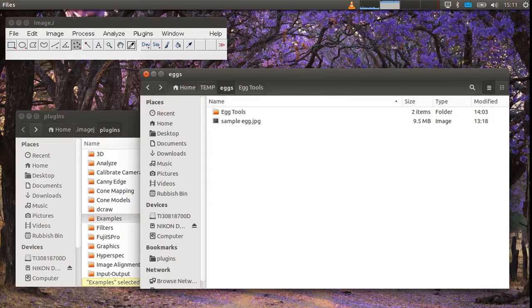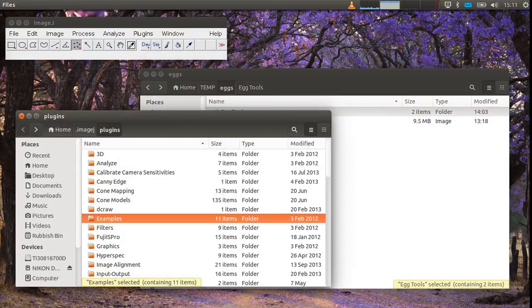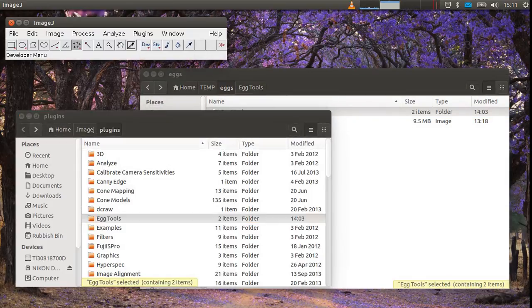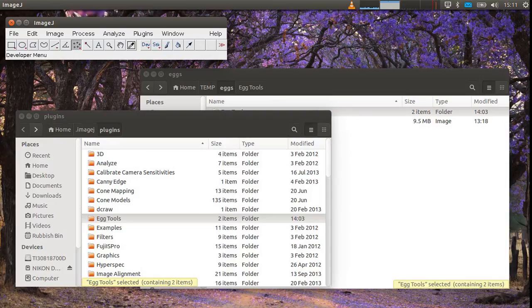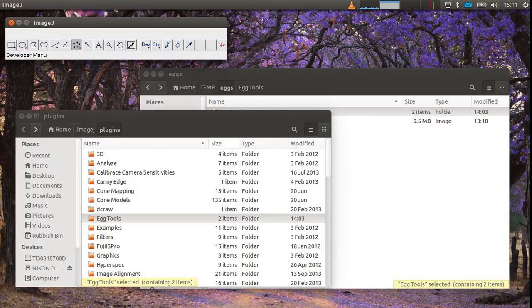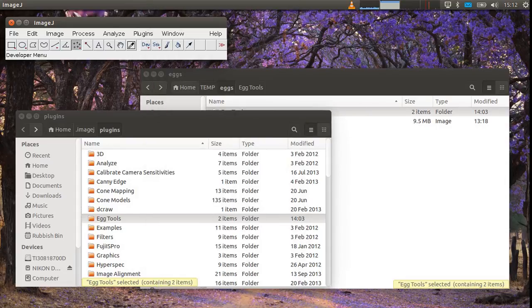All you need to do is copy across this folder to here and then restart ImageJ or if you've already got ImageJ open go refresh menus and that will load up the tools here so we have this new eggtools bit in the plugins.